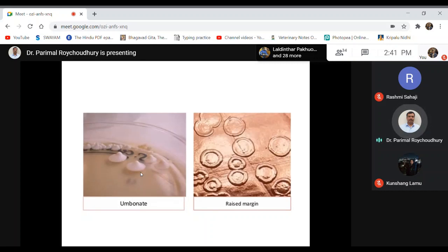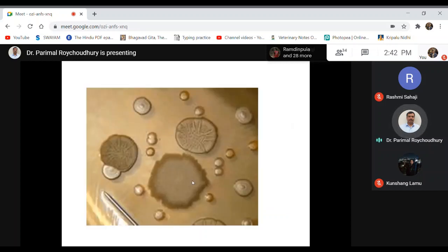It is something like why I am of this much size and shape. It's because I'm like this only. So for bacteria also, they produce this type of characteristic colony. And by studying these colony characteristics, we get a lot of information about the organism, and we almost reach near to the bacteria. In certain cases, like here in this picture, you can see several different types.